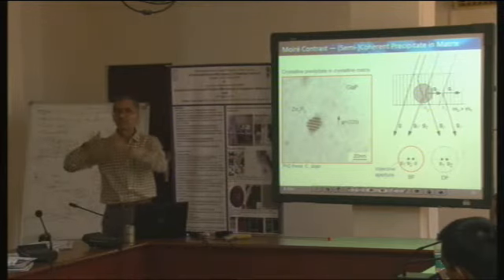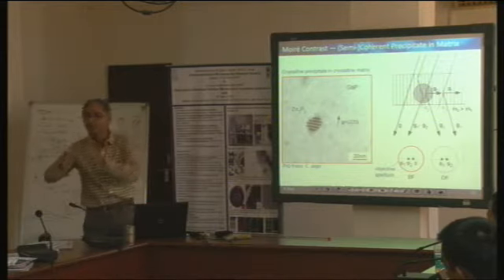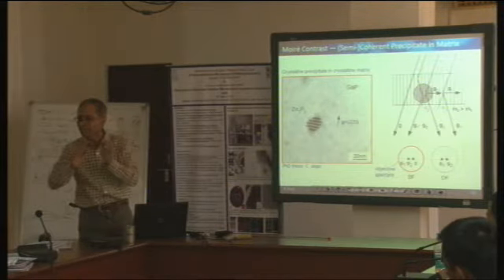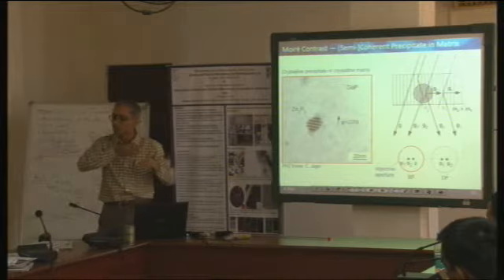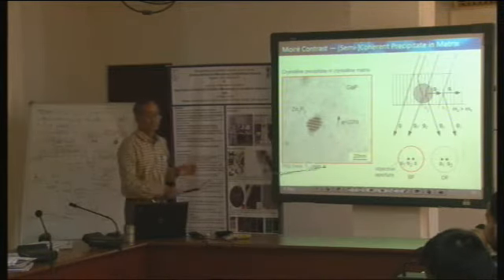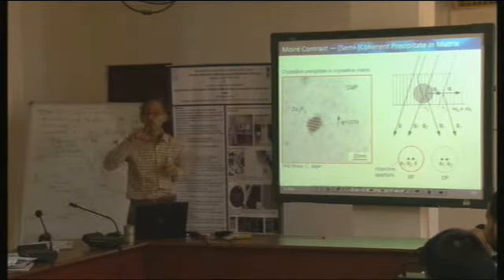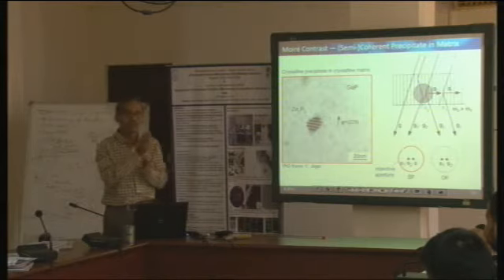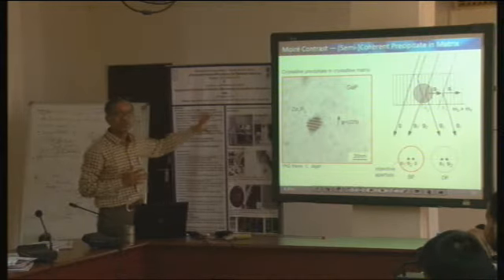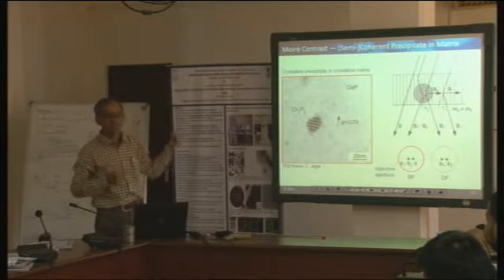In the diffraction lecture, you have heard that we get a zone axis pattern, and we get two beam diffraction, wherein only two spots are excited, as we go away from the zone axis. Now, this definitely is a case of two beam condition. I also promised right at the beginning that we will try to relate all the images to the diffraction conditions under which they were acquired.